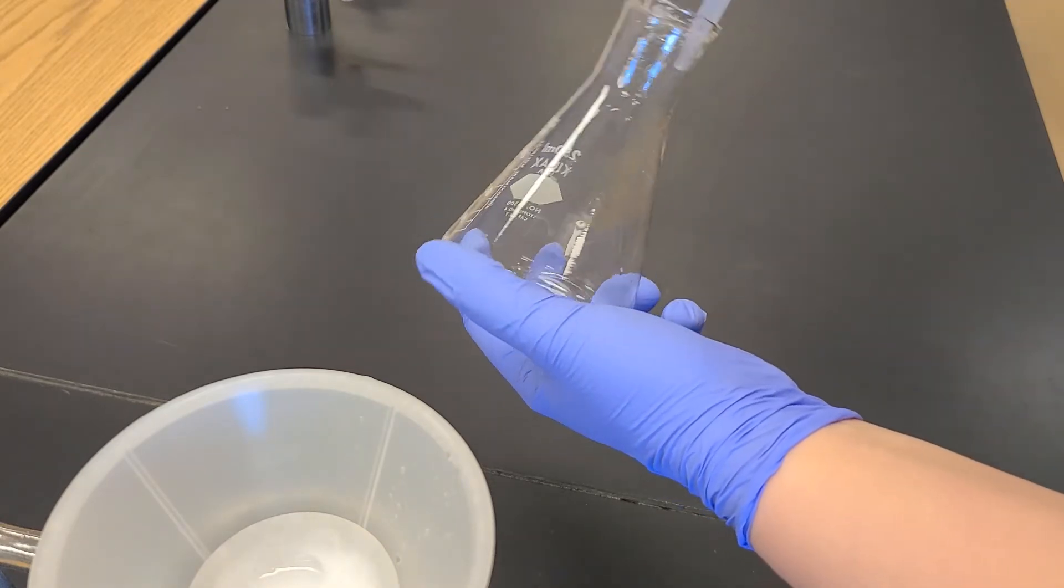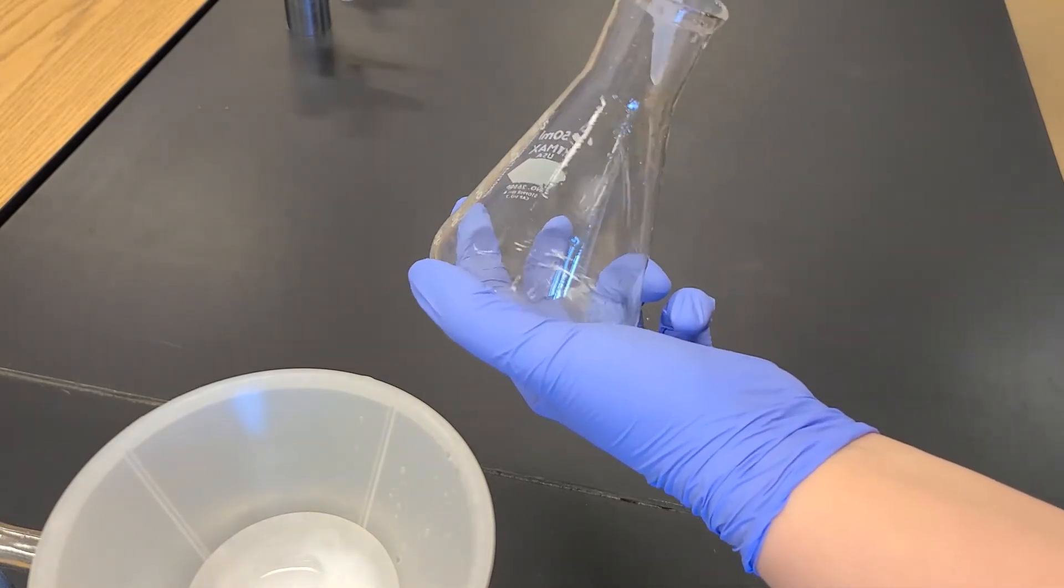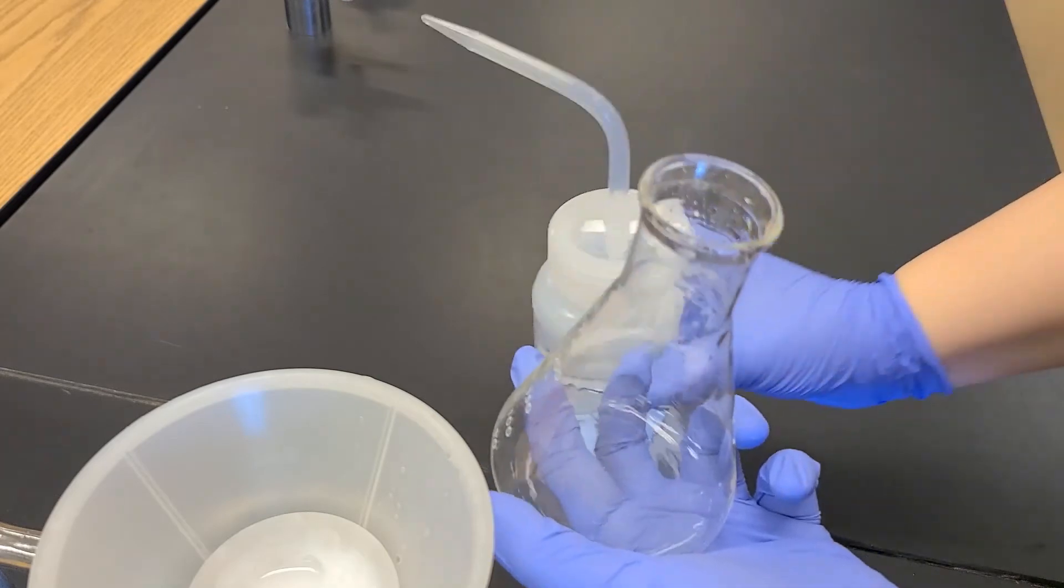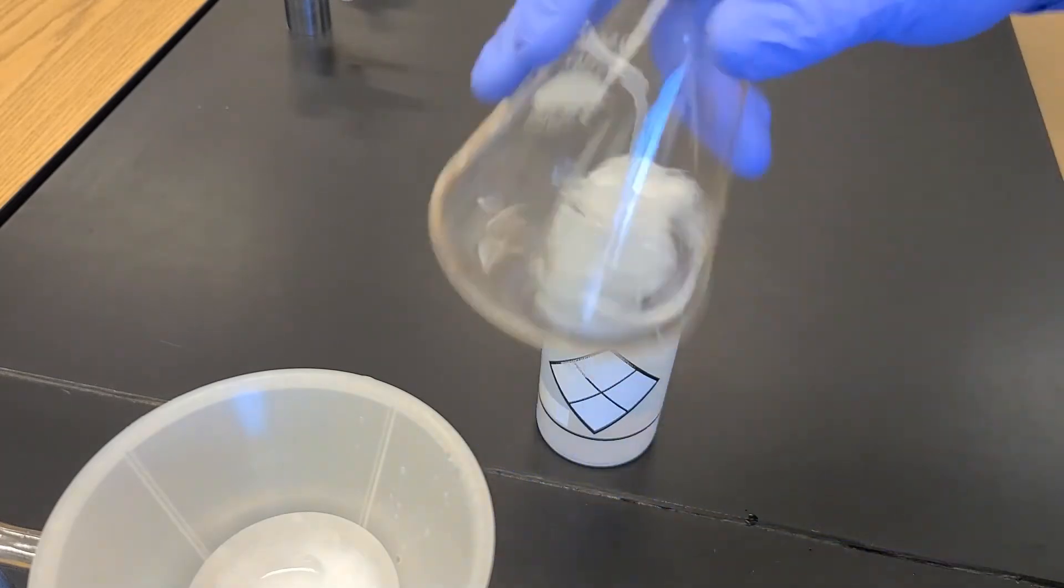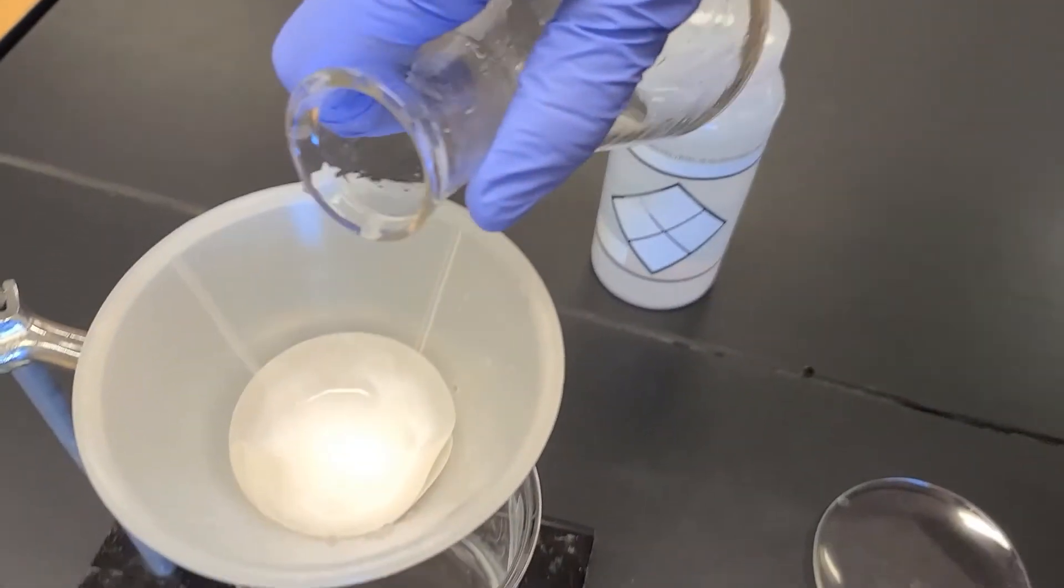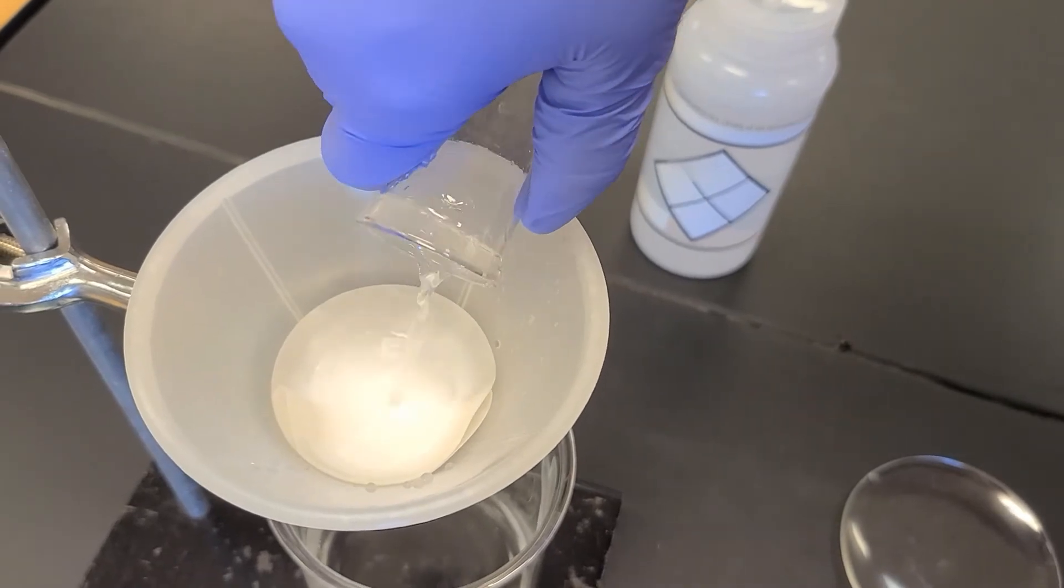We want to make sure we don't leave any of that solid behind because the mass of solid will help us predict the concentration of calcium and help us figure out how hard the water sample is.